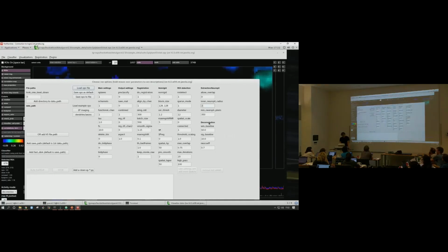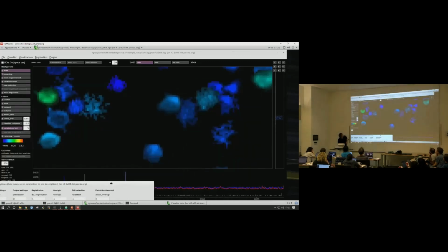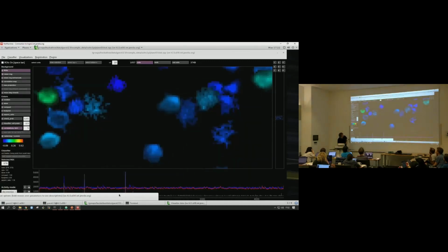All right, and finally the deconvolution. So the neuropil coefficient here that's being used in the deconvolution, by default it's 0.7. So that's the first thing that happens: we do a neuropil subtraction. And after we do that, we do a baseline correction in addition to that. So basically to estimate, let's look at a trace. We want to estimate the time varying baseline of these traces so that only the spikes, the transients, stand out.